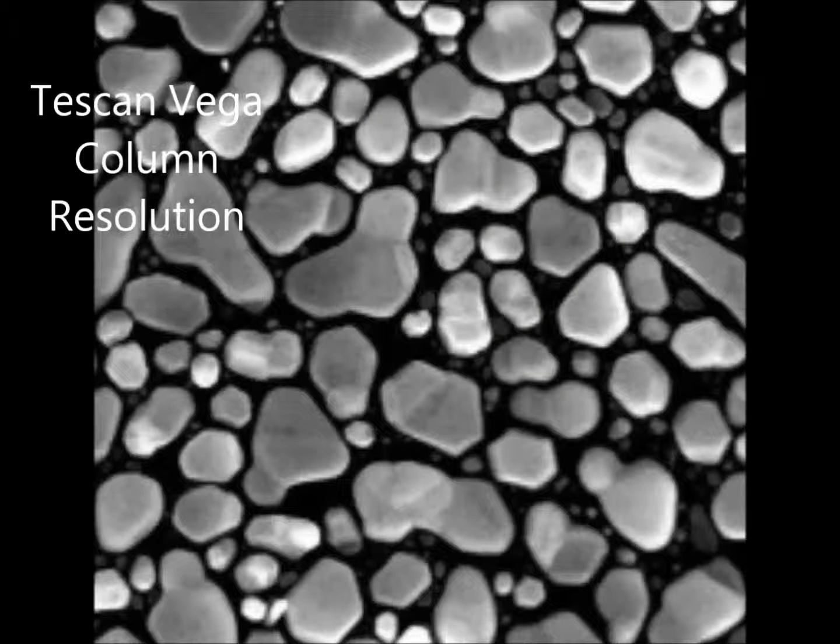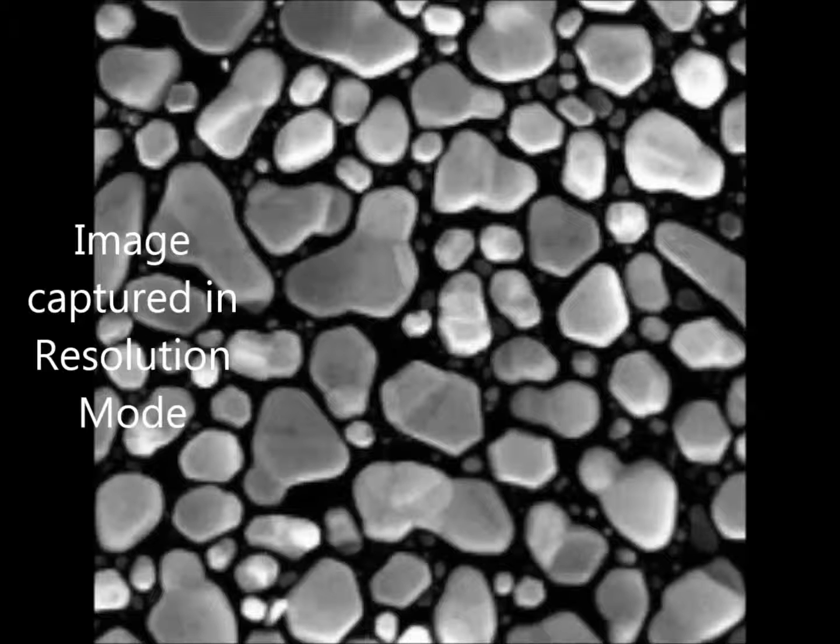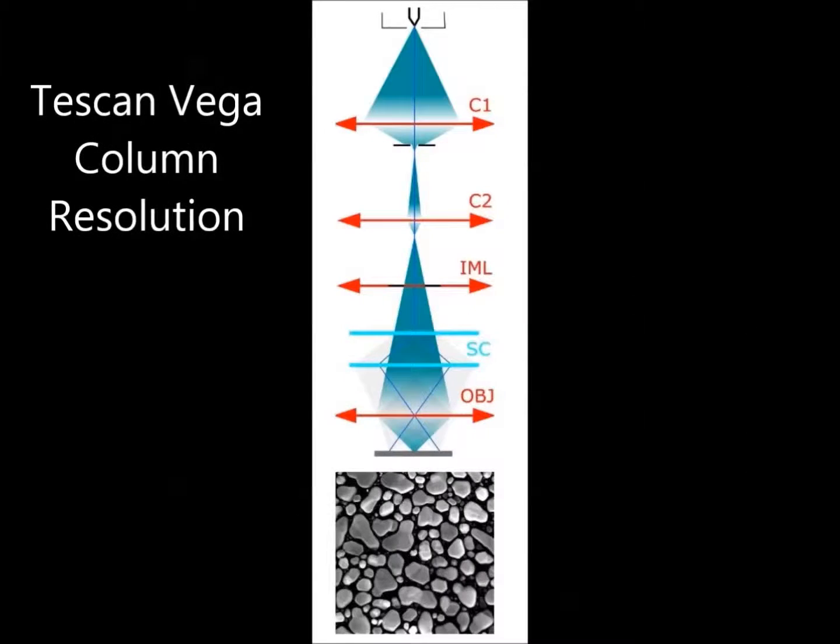The aperture is nearly optimal for lower beam intensity values, with a small spot size, a low beam current, a short working distance of about 4 to 5 millimeters, and an accelerating voltage of 30 kV. The pivot point of the scanning and the electron image shifts are close to the principal plane of the objective so that the field of view will be as good as possible. The centering of the objective is performed by a defined beam tilt of the central electron beam, which does not cause image shift. This mode is intended for displaying with the highest resolution.